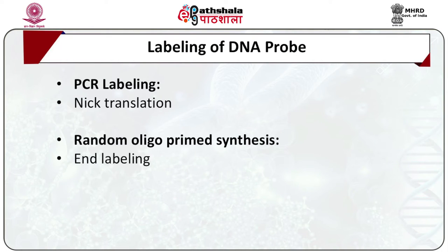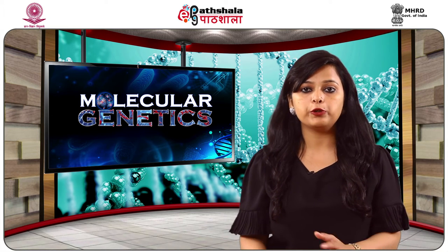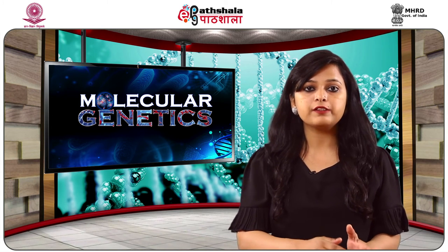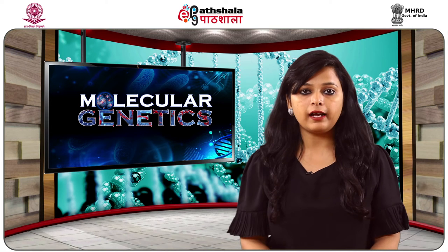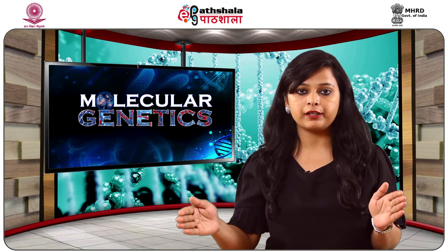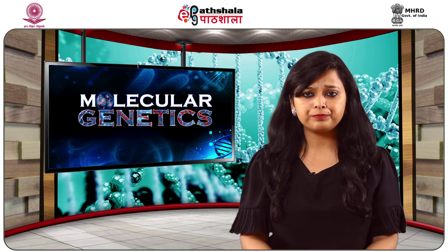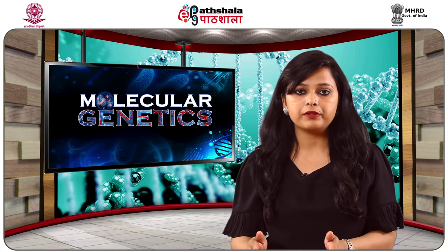Next is nick translation. In this process, DNase I and DNA polymerase in the presence of labeled nucleotide act on a double-stranded DNA sequence of the probe. First of all, DNase I will produce a few nicks in the double-stranded DNA sequence of the probe. Later, the second enzyme, DNA polymerase, fills and fixes these nicks by synthesizing the DNA in the 5' to 3' direction. Together, the exonuclease and the polymerase activity of DNA polymerase assist in the incorporation of labeled dNTP in probe sequences.